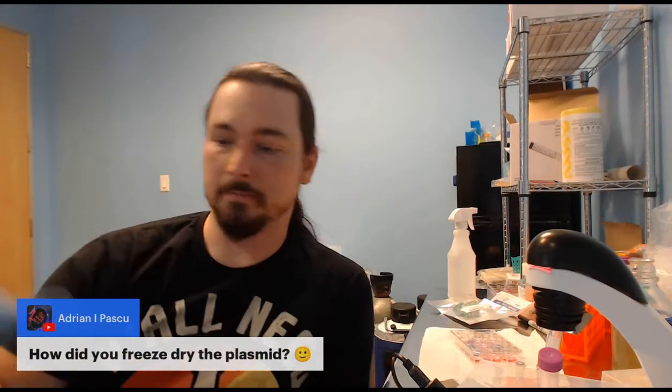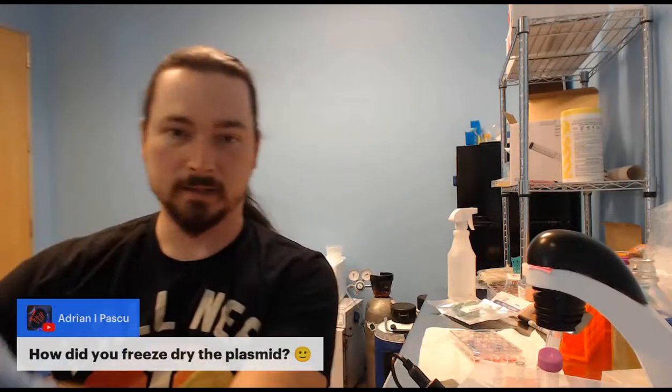So we have a lyophilizer here. It's like a vacuum with a chiller thing and a whole setup. But yeah, we just pipe that plasmid into the thing, add the dye, stick it in the machine, and freeze dry it.